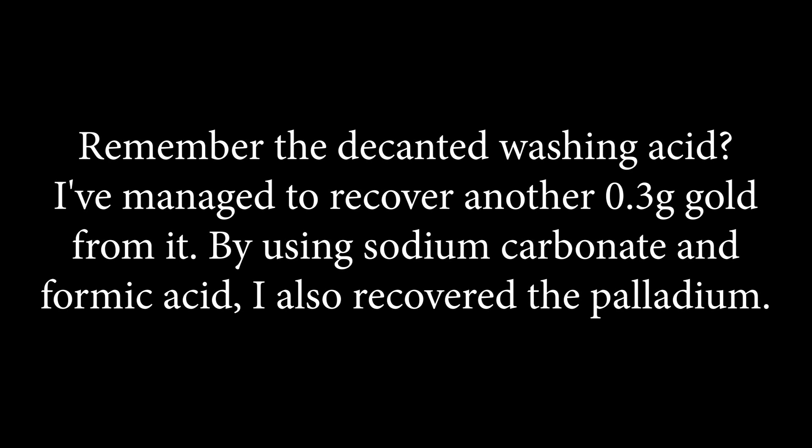Remember the decanted washing acid? I managed to recover another 0.3 grams of gold from it. By using sodium carbonate and formic acid, I also recovered the palladium.